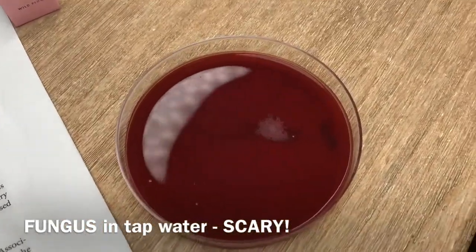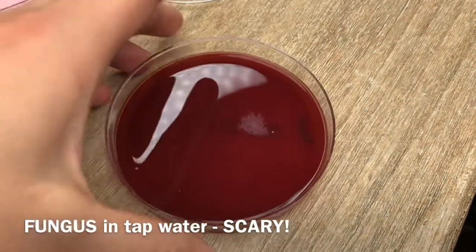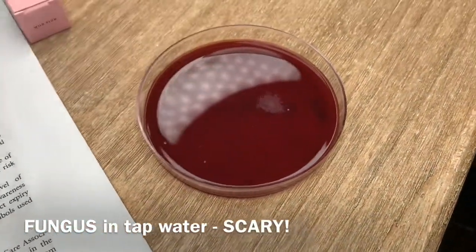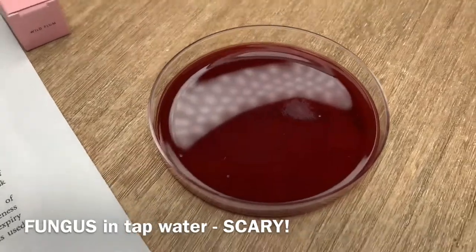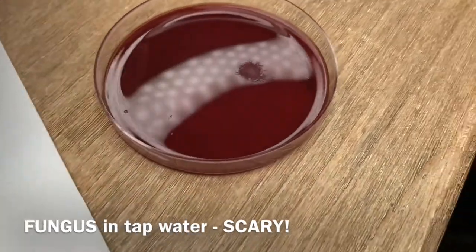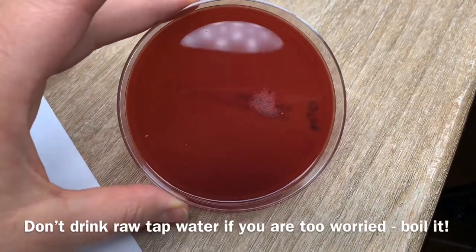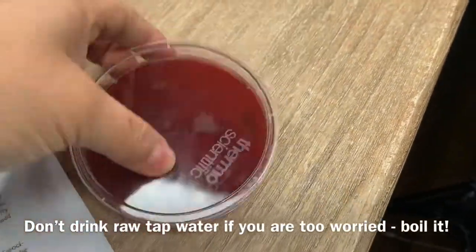I probably applied about at least 500 microliters, maybe even one milliliter of water and spread it all over the plate, and we just got five colonies. That's why you need to boil water when you want to drink tea or coffee — that's exactly why we're doing that.